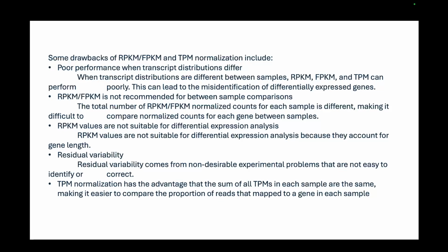So as I was saying, depending on the type of question you are trying to answer, a number of matrices can affect that question. If you're looking for differential expression, you need to account for those through this normalization procedure. If your gene length is affecting the number of reads that are going to show up, basically the number of transcripts getting expressed, then you need to account for gene length and normalize using gene length.